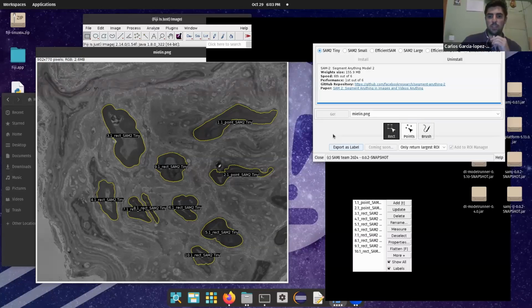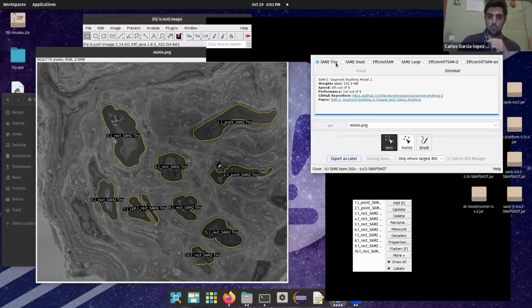The problem before was that in order to annotate 3D data, you need to encode all the images of the stack, all the slices. And as you have seen, this is quite a time-consuming step. But now with these new SAMJ models, this is much faster. So we need to find a way to make it user-friendly and understandable. But not now, it's not by default now. It's not supported here, but it will be. Sorry for this, August. And I hope this answered your question too.